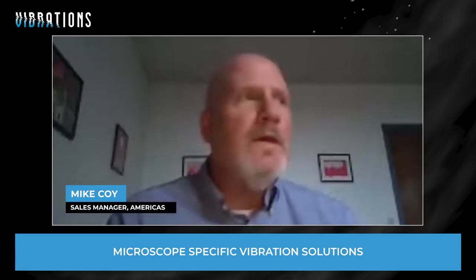TEM now is a completely different situation, right? In TEM, your sample preparation has resulted in an electron transparent sample. So you're actually sending your high voltage beam of electrons through a sample material.